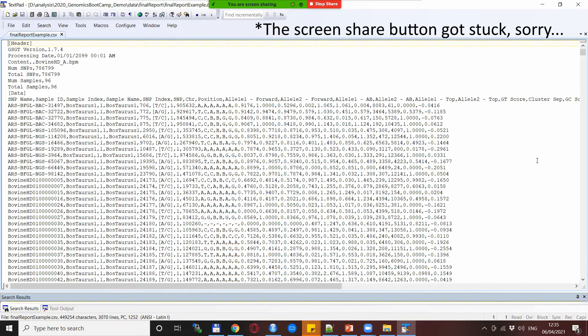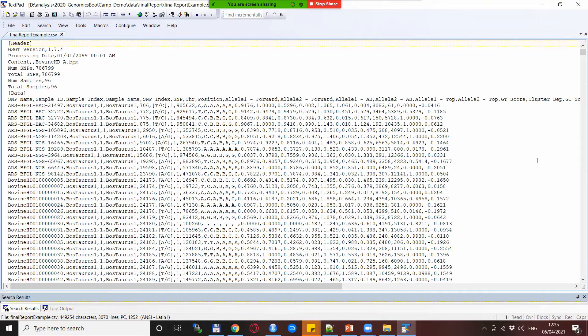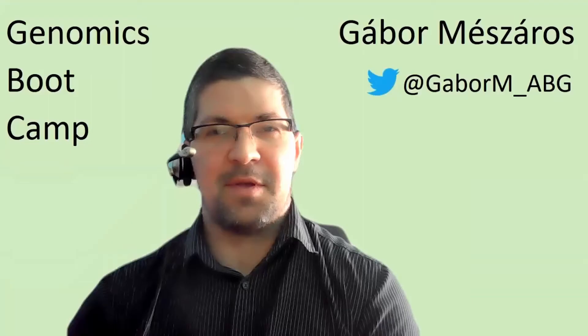So we will look at what they contain and why they are so important and frankly also quite interesting. This is how the final report looks like. It's just a big text file basically with one line for each SNP and each individual.